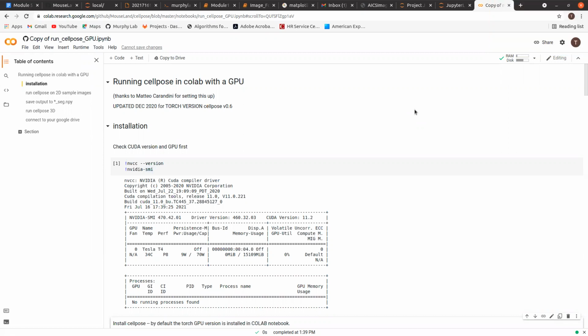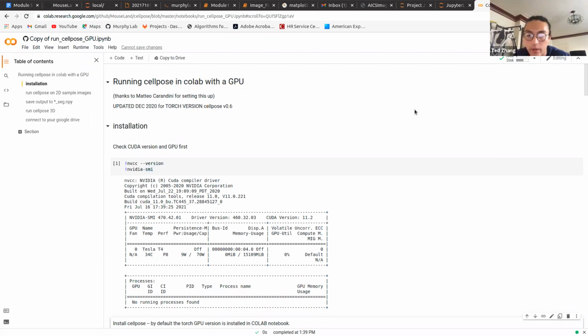So all ones would dictate this is where cell 1 is in the resolution, and then all 2s is where cell 2 is. So what you would have to do there is, I think in CellOrganizer itself, there is a way for you to write out a mask. So yeah, there's a lot of functionality in CellOrganizer.